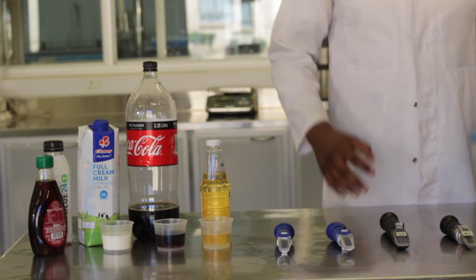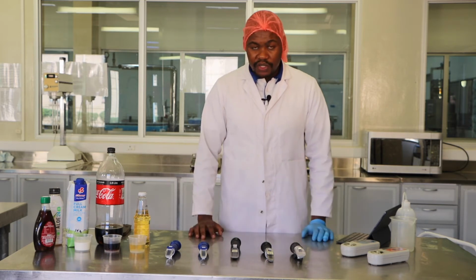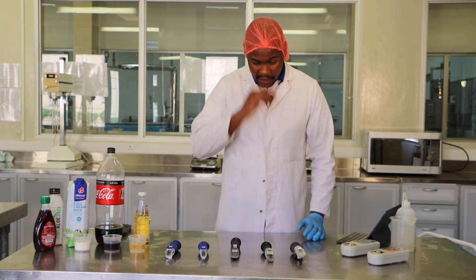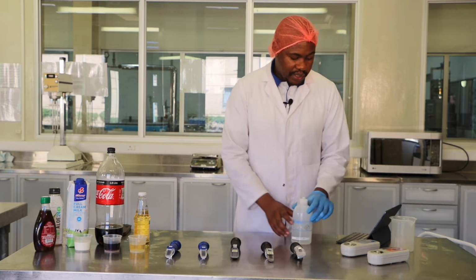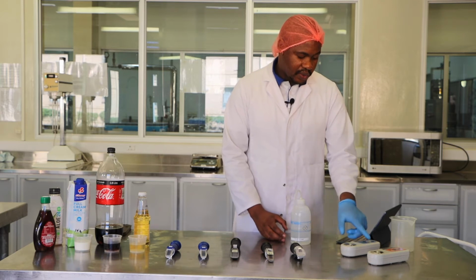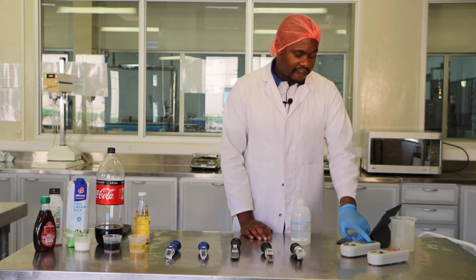Right? Now I want to attempt to measure the sugar or salt concentrations of the substances that I have here in front of me. So we're going to do that. First of all, I'm going to check the degree Brix and calibrate my digital refractometer. The scale that I have here says 0 to 45%.